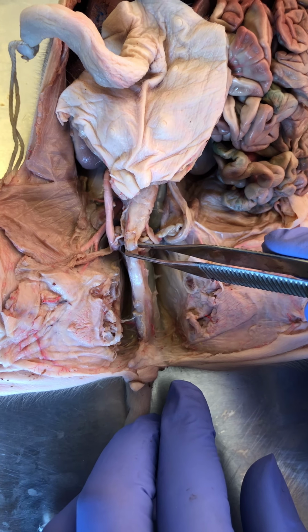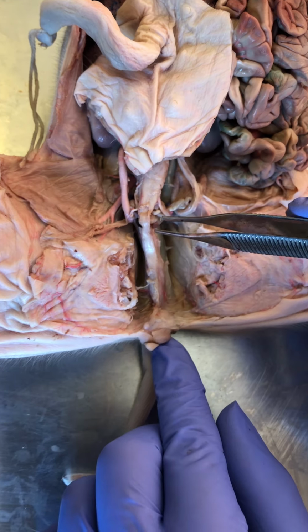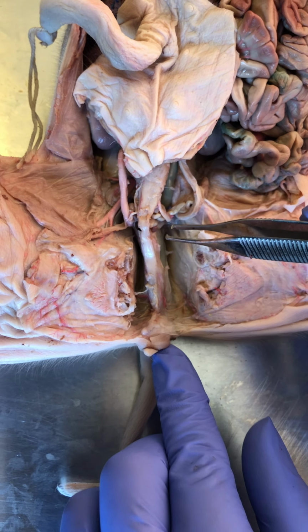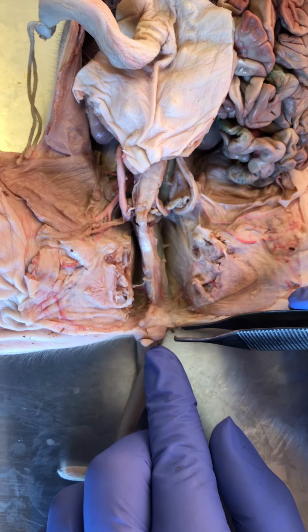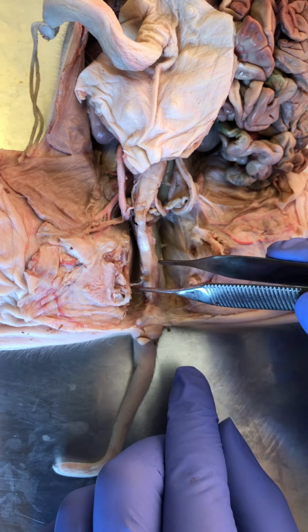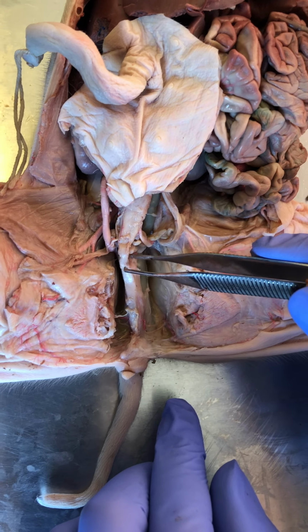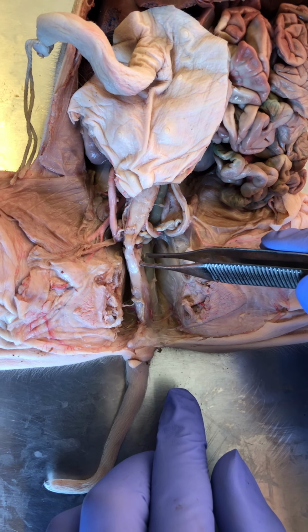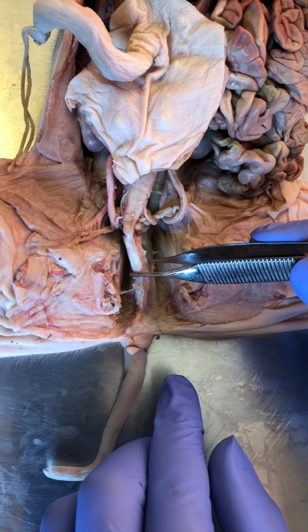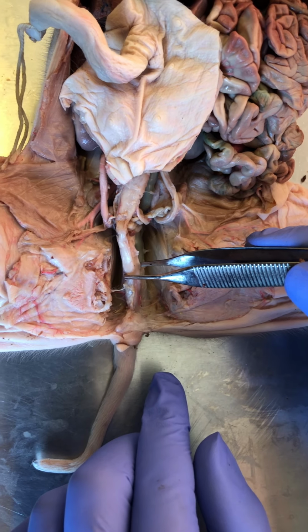That's the urethra. For humans, we're used to the urethra going all the way out to our urinary orifice. But remember, they don't have a distinctive urinary versus genital orifice. It's urogenital. So here's the urogenital canal. You're going to see when we cover the reproductive structures that this urethra is fusing with the vagina, and so we're going to end up with just one urogenital canal. That's it for the female.